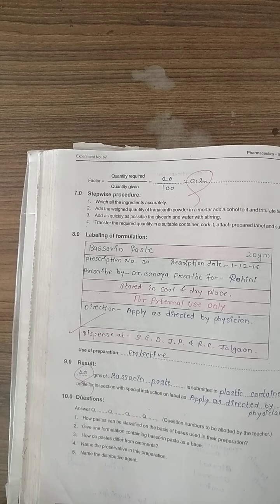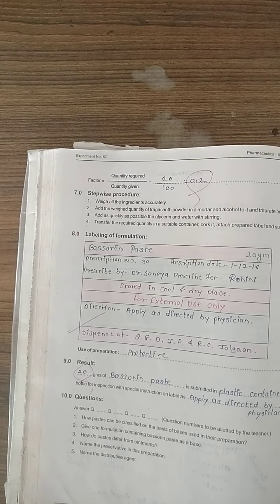Weigh the required quantity of tragacanth powder and place it in a mortar. Add alcohol and mix briskly. Then add glycerin and water progressively with continuous stirring. Then prepare the final bassorine paste, label it, and submit it. We use bassorine paste as a topical treatment and for burns. Experiment number 67 ends here.